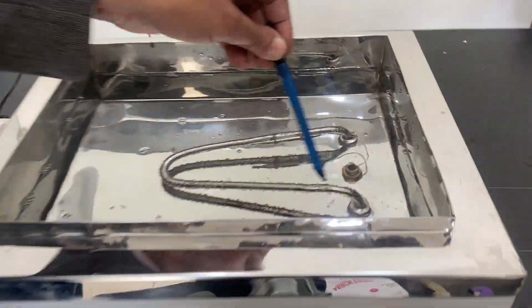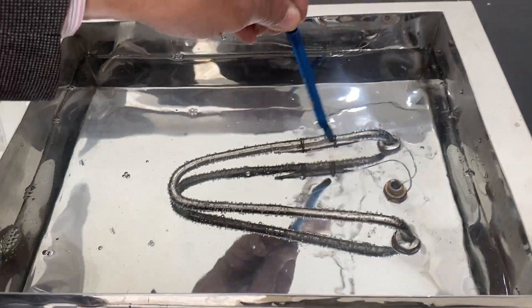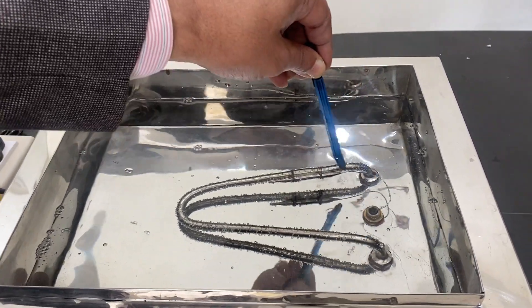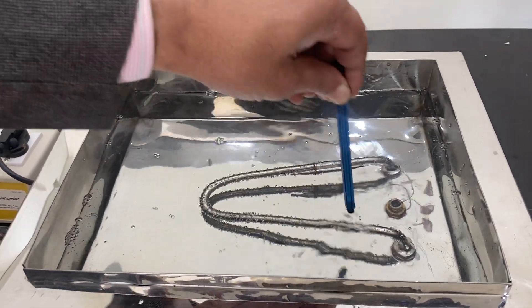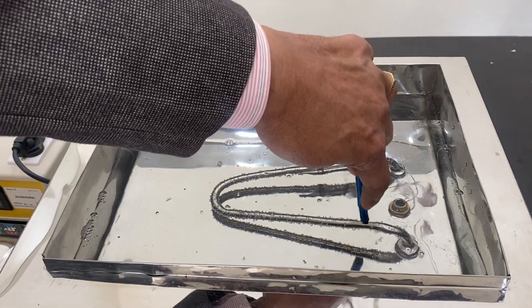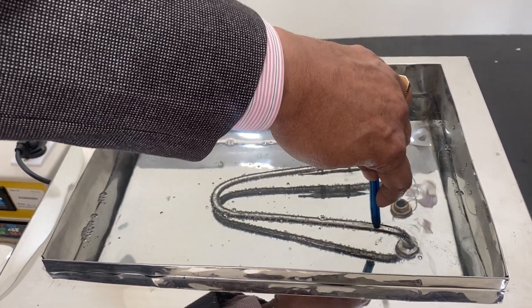This is a heater and this one is a thermostat only, with the capillary wire. Take care this does not break, and water should always be above. I have kept the water about one and a half inches above this heater.